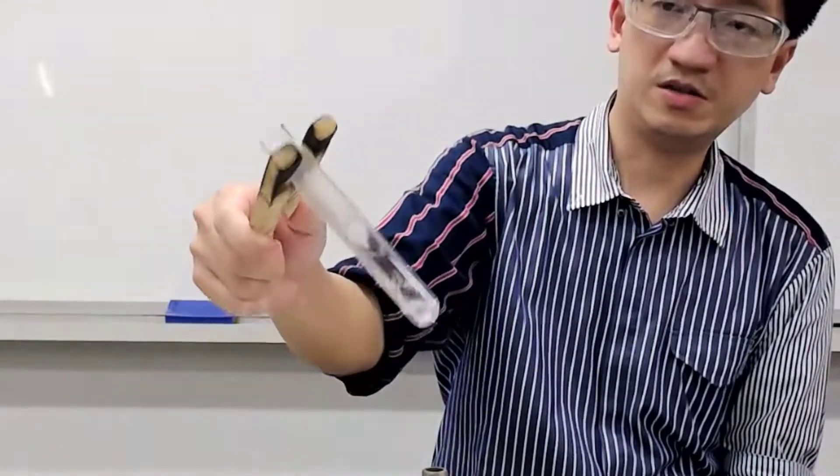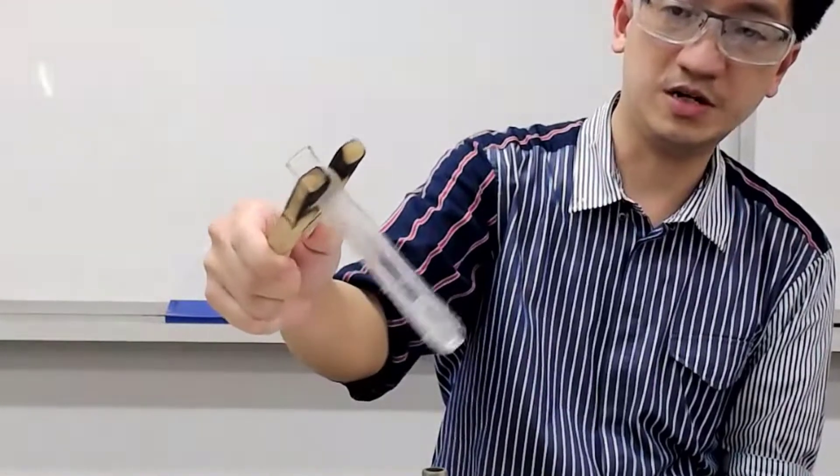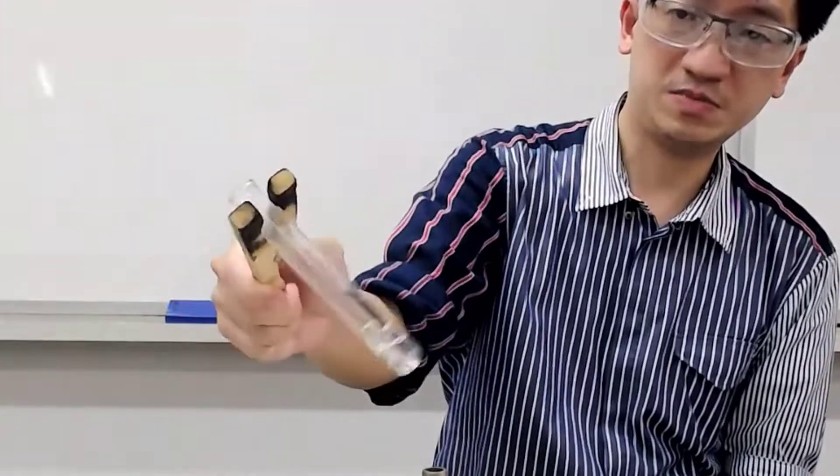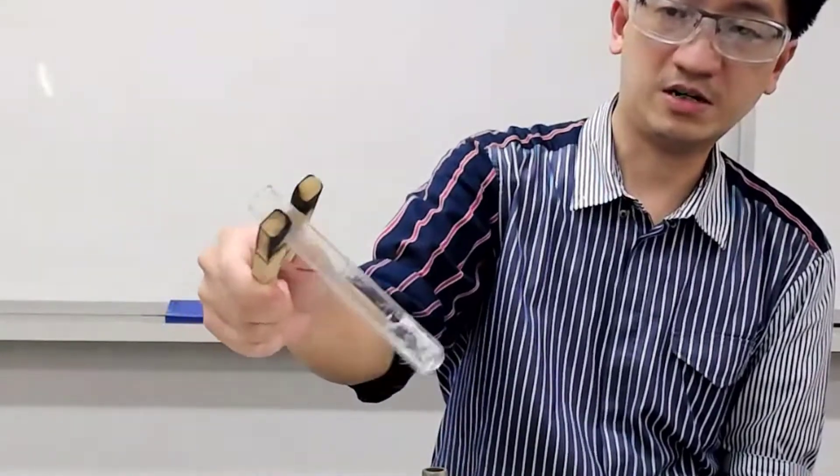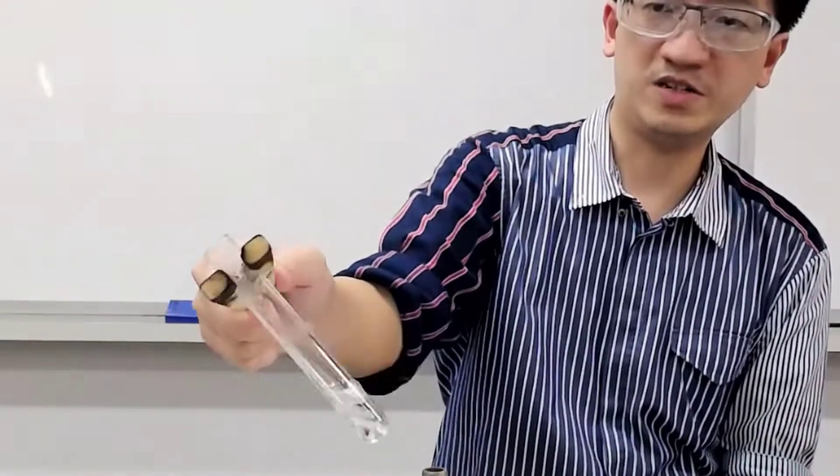Now you can see that most of it already liquefied or dissolved in its own water of crystallization. Do take note of the color. You can see that it's colorless. I think now you can start to observe some of the gases evolving.